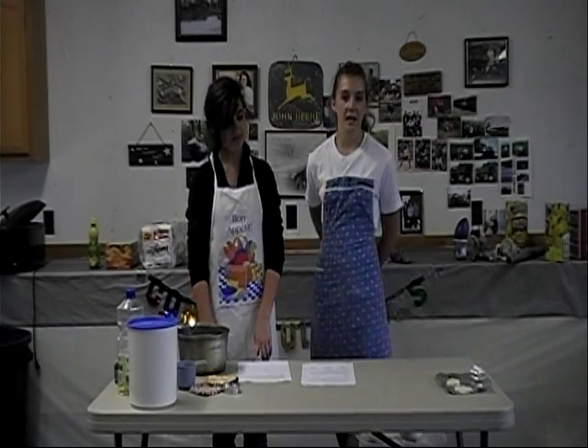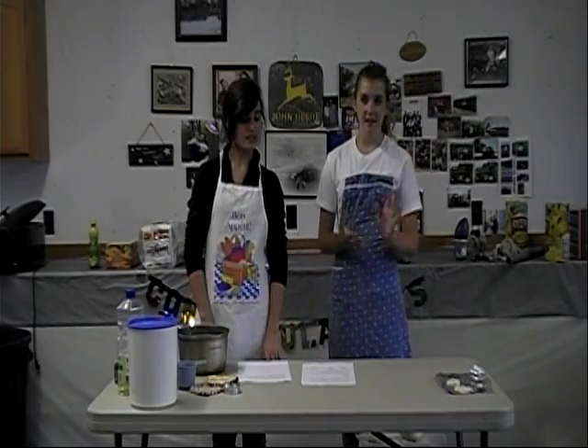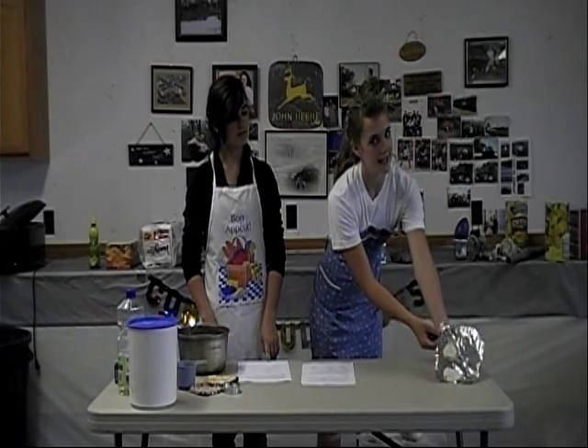Your first step will be to tear off about 12 inches of foil. It doesn't really have to be a specific amount — it's just to put your samples of clay on.